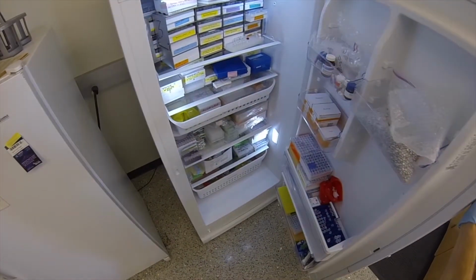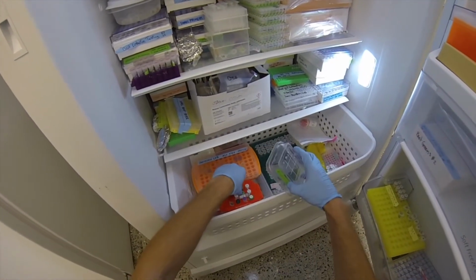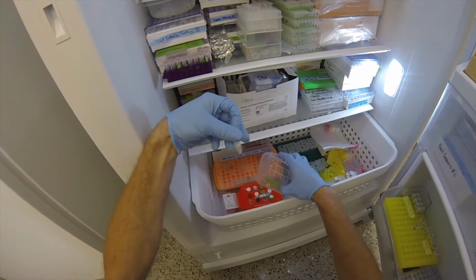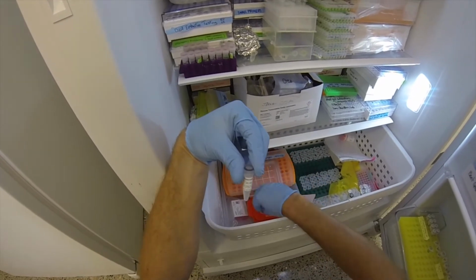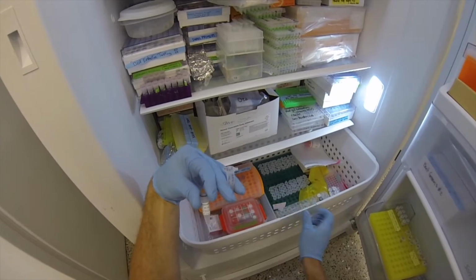Now we need to grab the proteinase K and RNase A. You can go to the -20 freezer and look in the enzyme box. It's a red enzyme box on the bottom drawer for the proteinase K and RNase A. Bring these back to the lab bench and place on ice.